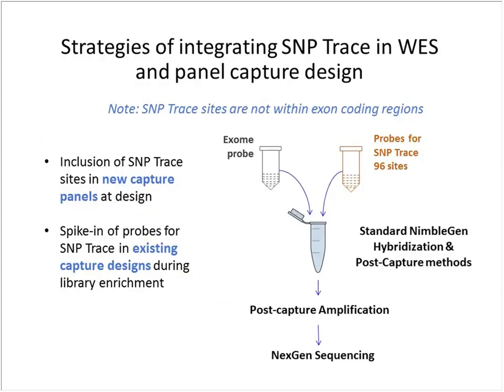One thing I need to point out is that the SNP Trace sites are not located within the exome coding regions. So for our exome sequencing or panel sequencing, which mainly sequence the coding regions, we need a strategy to integrate the SNP Trace sites into our capture panel.